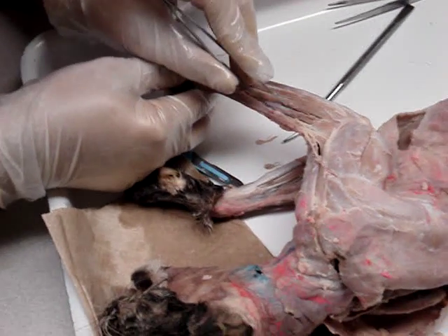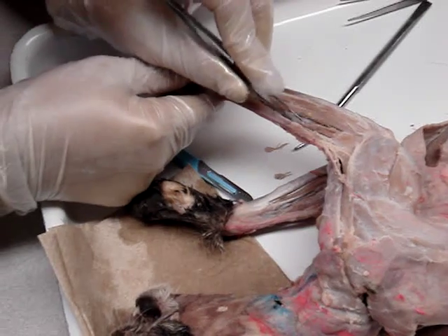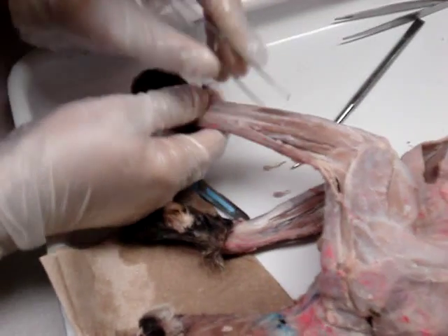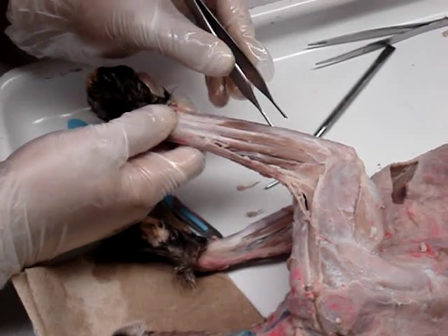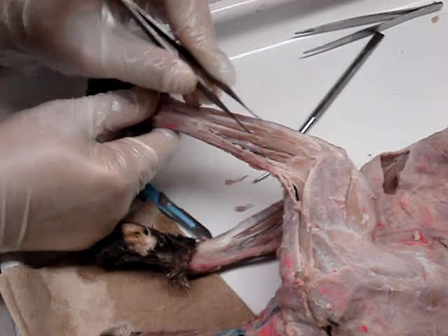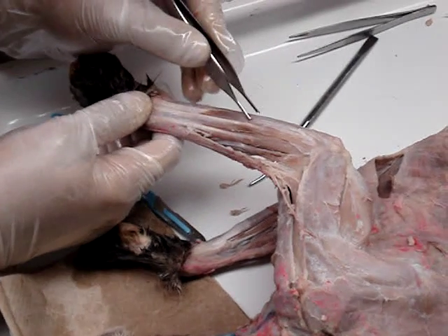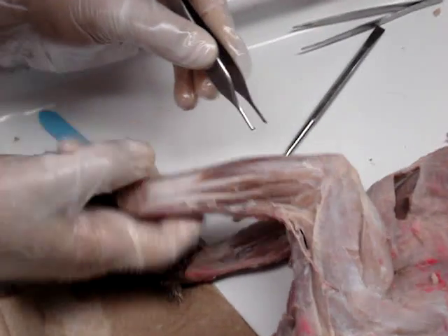So we're going to start with this. That's your extensor digitorum, extensor carpi radialis. Okay, then you're going to hit two — the digitorum — and then you're going to hit ulnaris again. So extensor carpi radialis, extensor digitorum communis, lateralis, extensor carpi ulnaris, and then you hit the flexors — flexor carpi ulnaris.